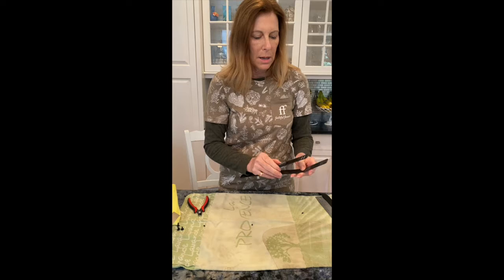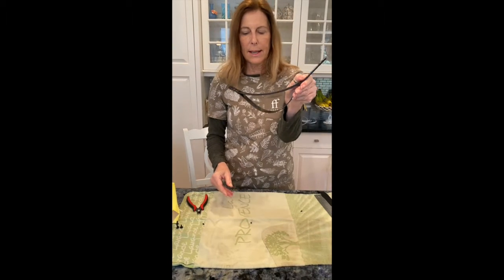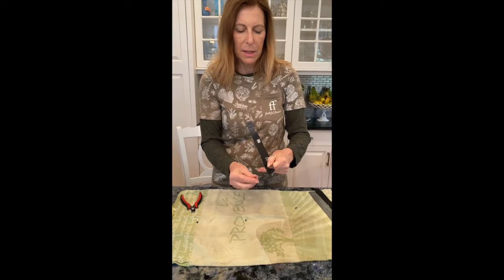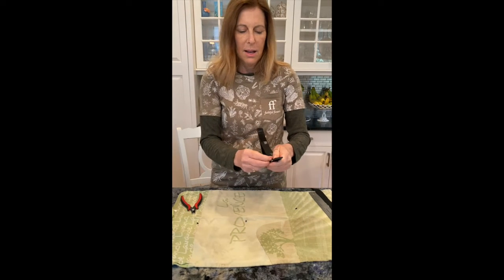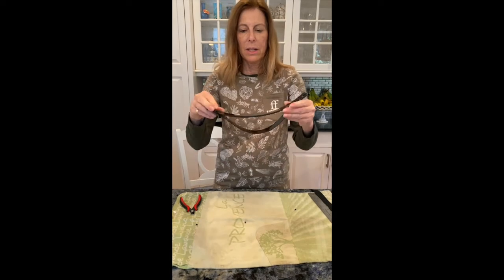Then I'm going to bend it so you're going to get that shape here. Put your little snappy things in — going to have good hand-eye coordination here. There you go, looking pretty good already.